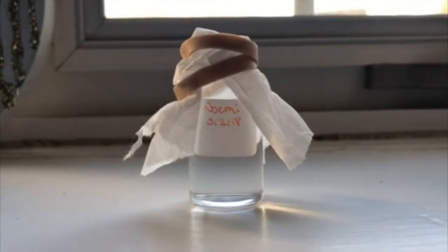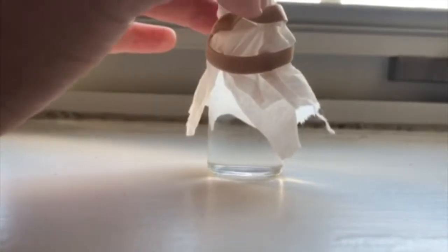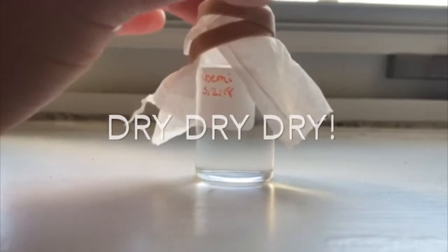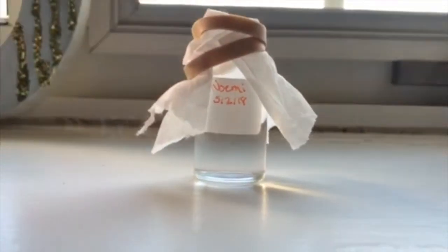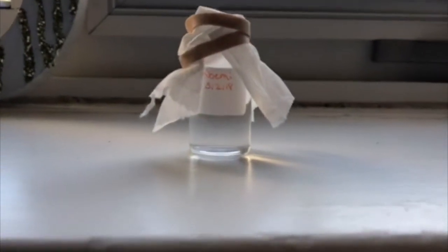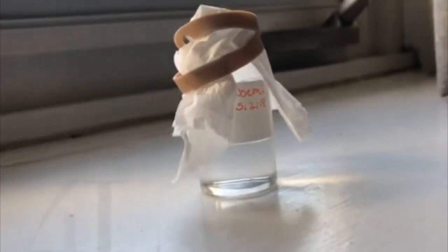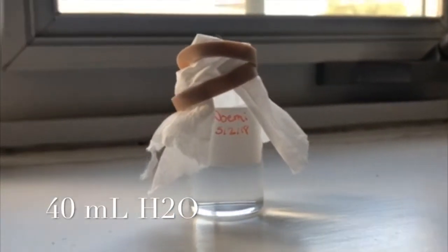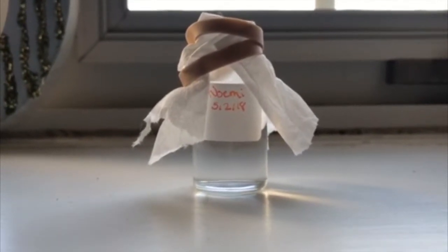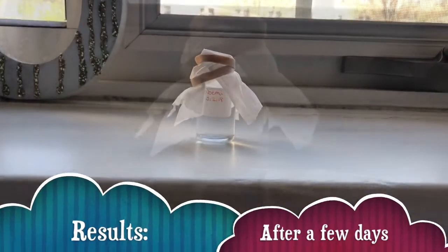So then after we collected this solid alum, we washed it with a 50-50 ethanol water mix that we created. We dried it using a vacuum filter suction, and we used this to make the saturated solution we have now in the vial. So to make the solution, we just added 8 grams of alum and 40 ml of water. And then just using regular gravity filtration, we got rid of any remaining impurities that could have been in the solid, and we split it into 3 different vials, 1 for each lab partner.